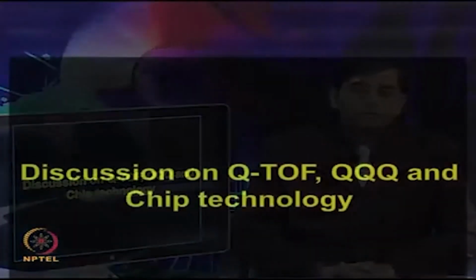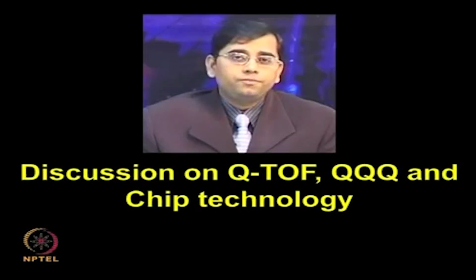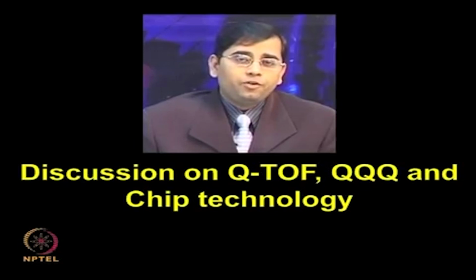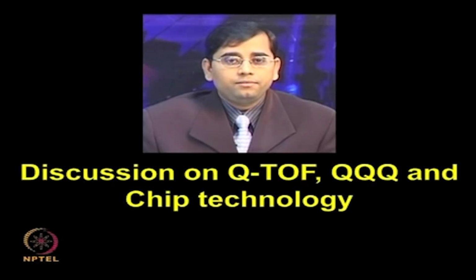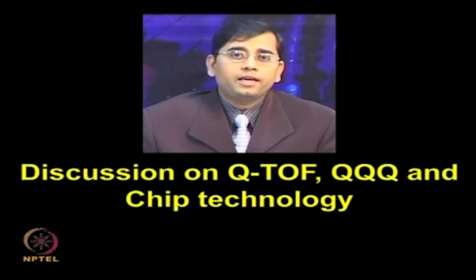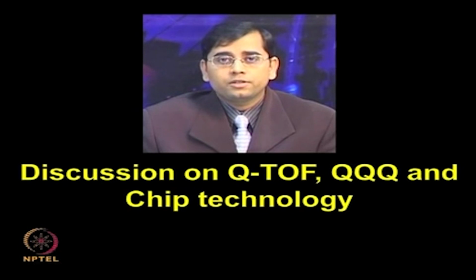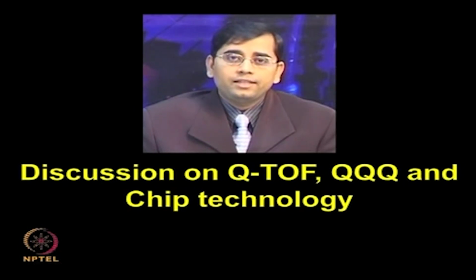So, we will discuss quadrupole time of flight and triple quadrupoles. What are the advantages of using these types of hybrid configurations? What is the latest chip technology? How can it be used to overcome several limitations of HPLC based methods, liquid chromatography, which is used prior to the ionization methods?